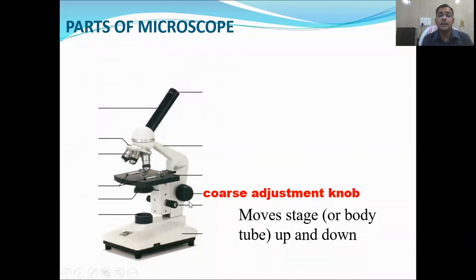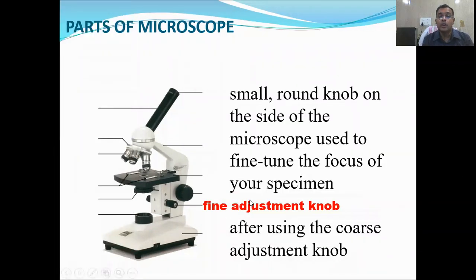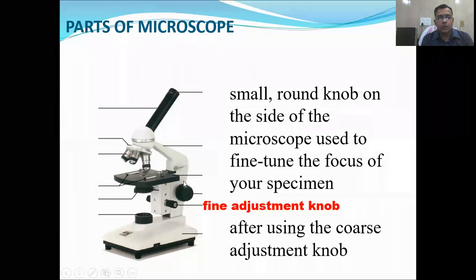And once we are near to our object, then we have to move to the fine adjustment. So you have to start with a coarse adjustment. Once you are near to your view, you have to adjust with fine adjustment to refine your view.